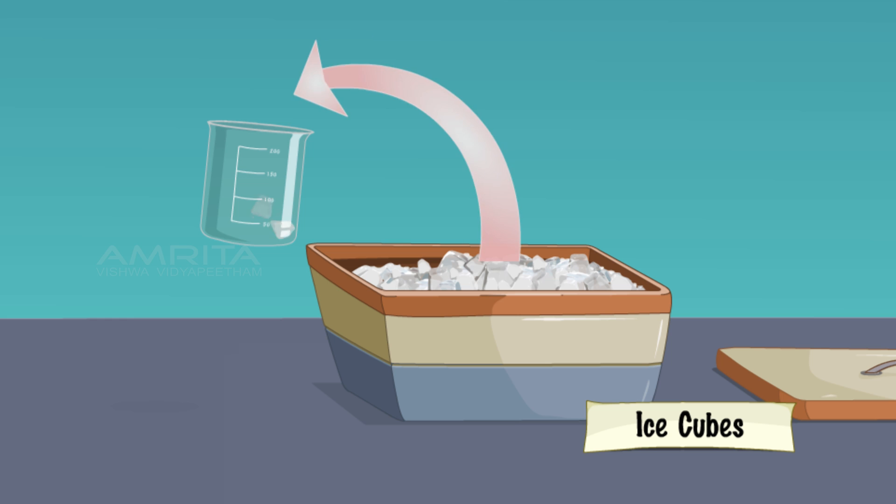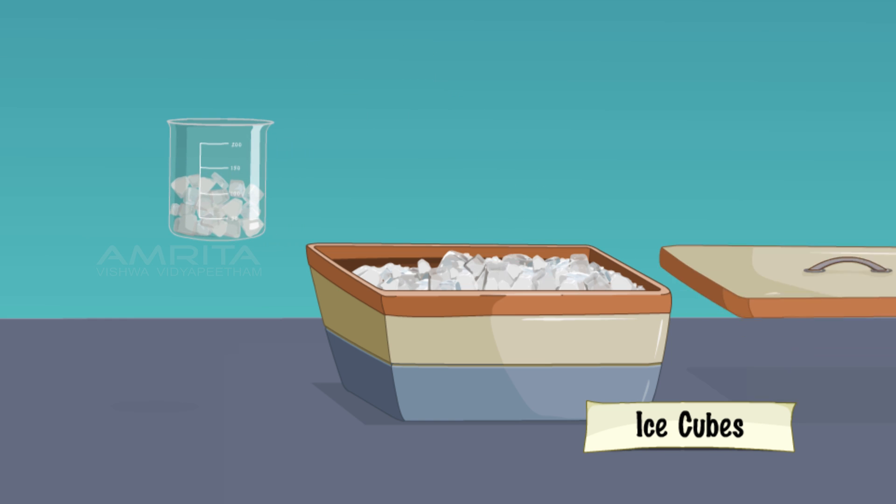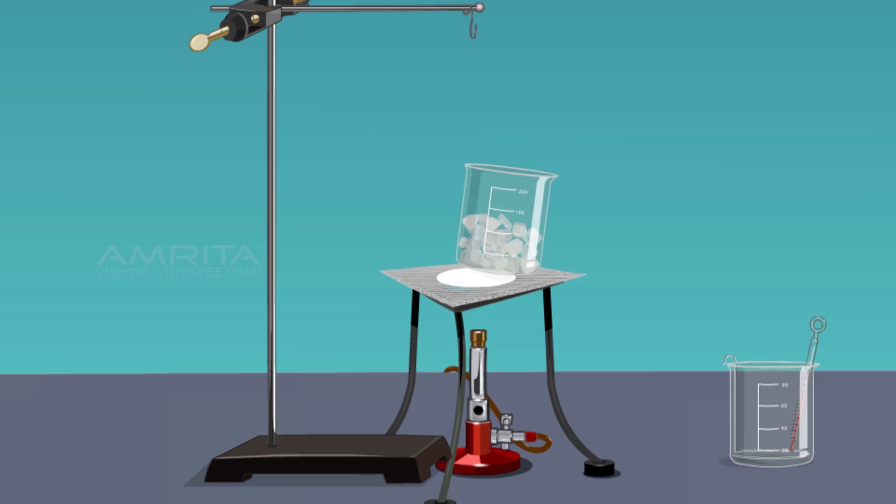Take some ice cubes in a beaker. Place the beaker on a wire gauze, keep it over a tripod stand and insert a stirrer into the beaker.